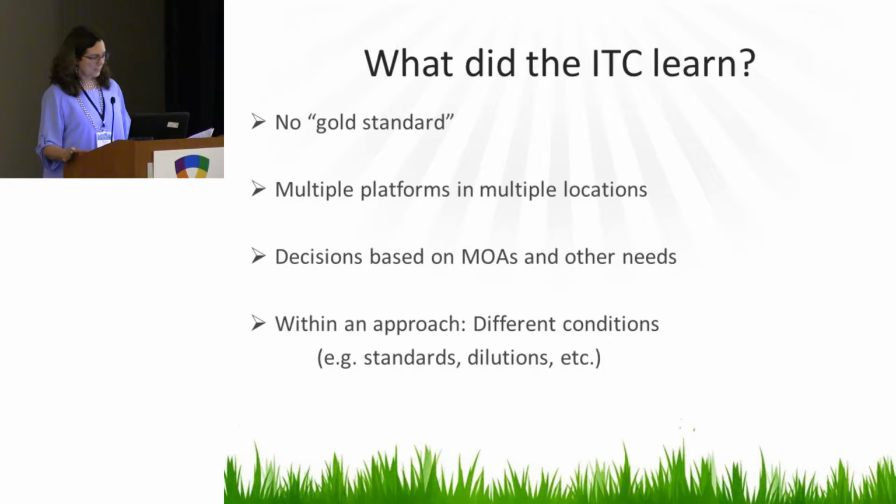Could be the target, the cell population that you're going after, any potential for cross-linking or not cross-linking. Is there an Fc-related mechanism contributing to the potential? Are soluble factors involved? Interaction between endothelial cells, etc. And so basically, there's a need to tailor the assay for the particular program.